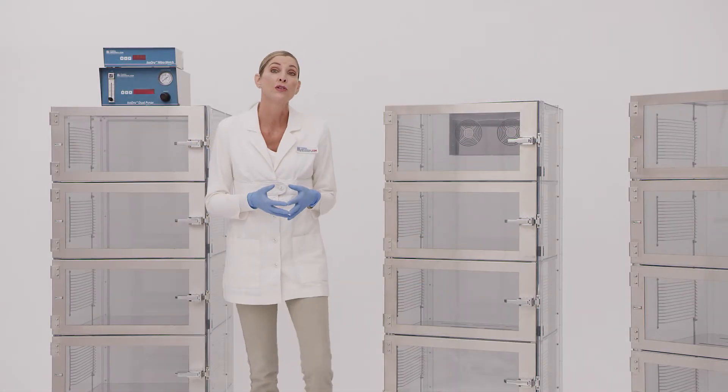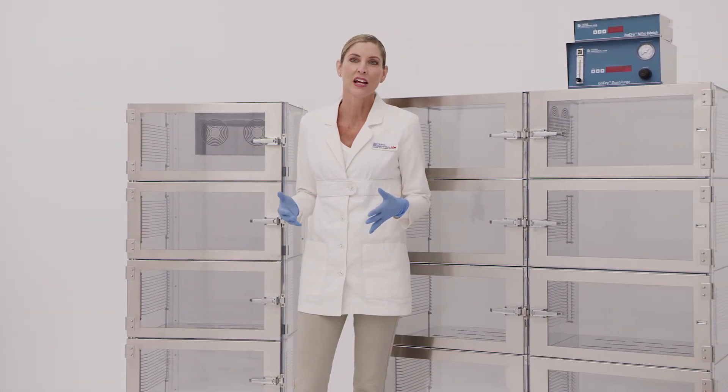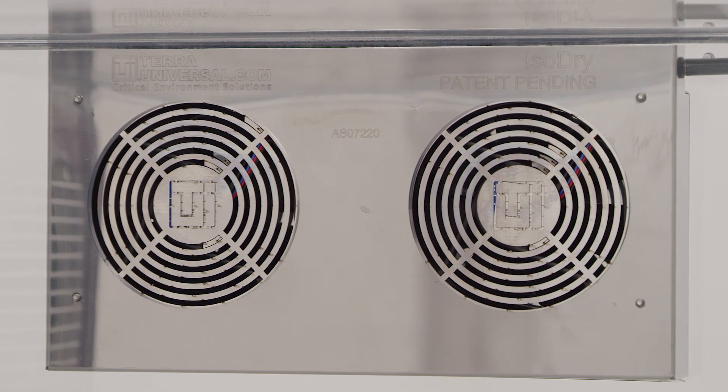The patented ISO-DRY system changes all of that. When you choose an ISO-DRY desiccator, you get a patented twin fan dilution module that rapidly mixes and circulates the incoming nitrogen.